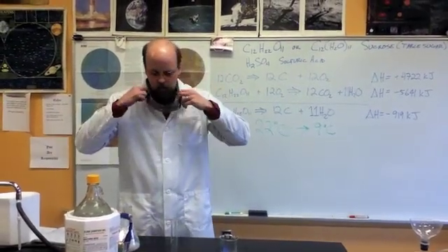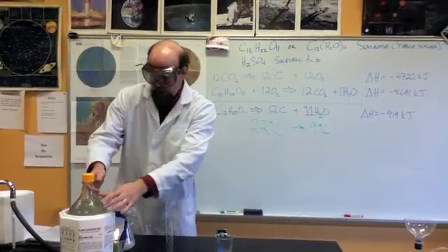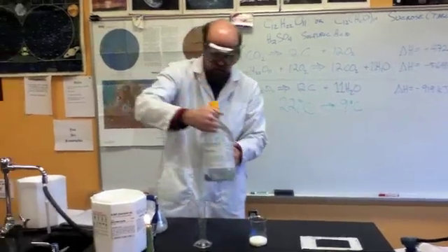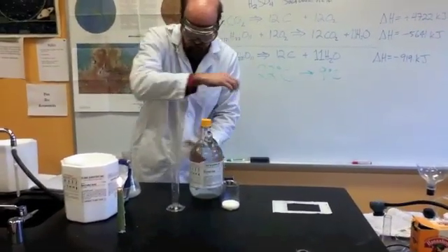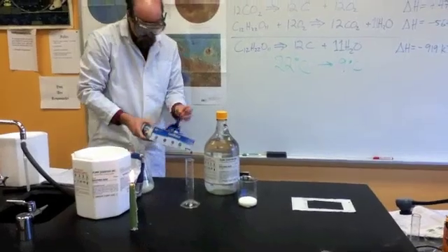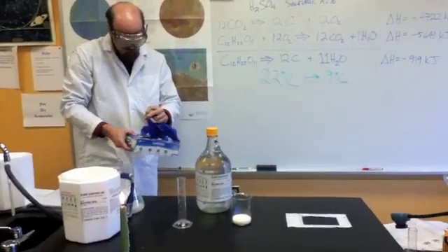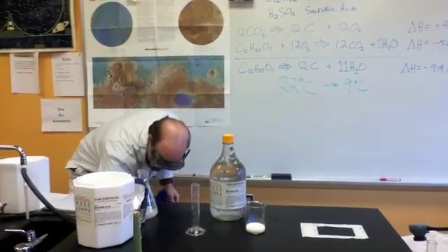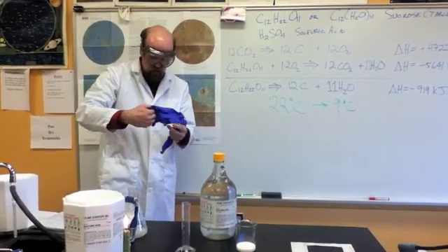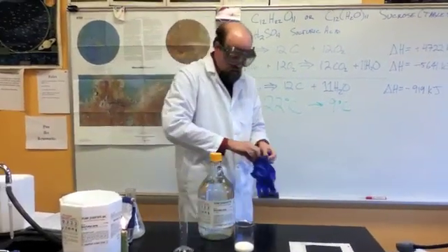But enough chitchat. Let's actually do the demonstration. So this is concentrated sulfuric acid. It's really heavy, extremely dense material, and something you don't want to handle without proper protection. That's why I'm wearing safety goggles, a lab coat, and I'm going to put on these rubber gloves.